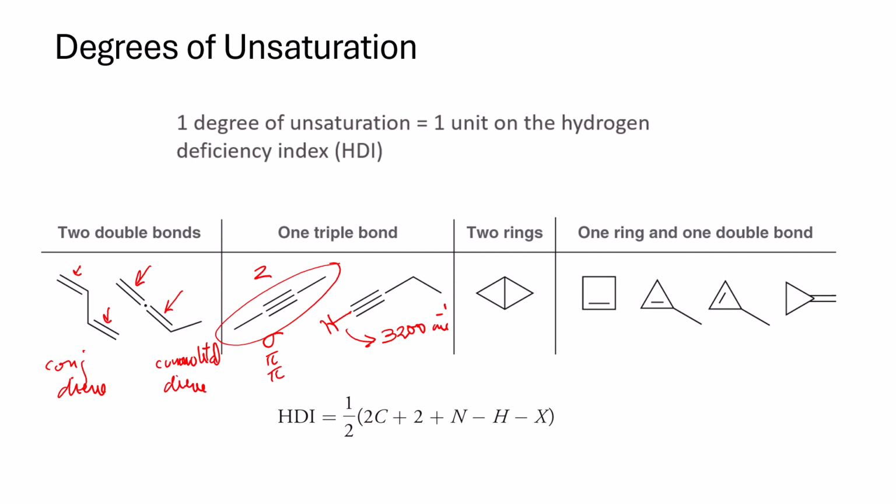Now, we just saw before that cyclopentane and pentene have the same number of unsaturations. So one ring counts as 1 unsaturation. So 1 unsaturation can be a double bond or a ring, which is what we did in pentane: 1, 2, 3, 4, 5. So in that case, let's redraw this.